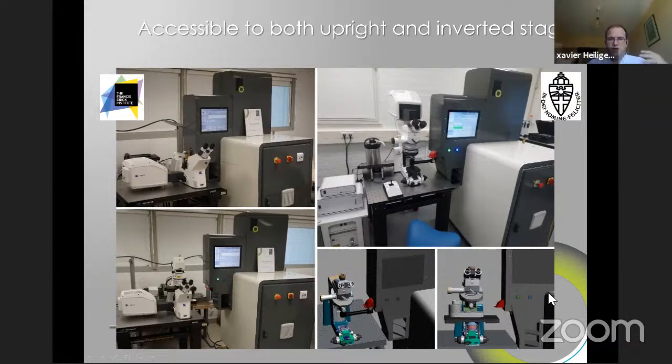So as you can see now, we start to have something very flexible. With one microscope, you can start to do many different approaches using high pressure freezing, which is a key element, because high pressure freezing is to date the only way to have a close to native ultrastructure preservation in EM of thick samples, as opposed to plunge freezing, which is limited to 10 microns in depth.